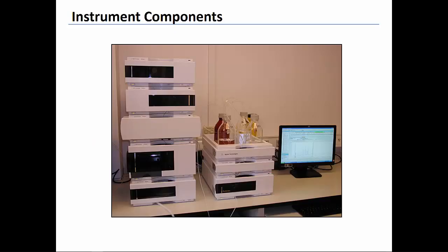In order to save bench space, modern HPLC instruments are configured with stackable components. This picture illustrates a typical HPLC system manufactured by Agilent. The solvent bottles are placed in a secondary container which rests on top of the pump.